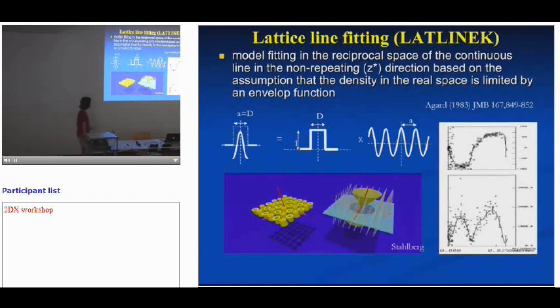So we have all these lattice lines in a space. Then if you draw that in the Z direction of one of them, you get here, this direction is the Z star, and then you can draw your amplitude and the phases on it. Then try to fit that.